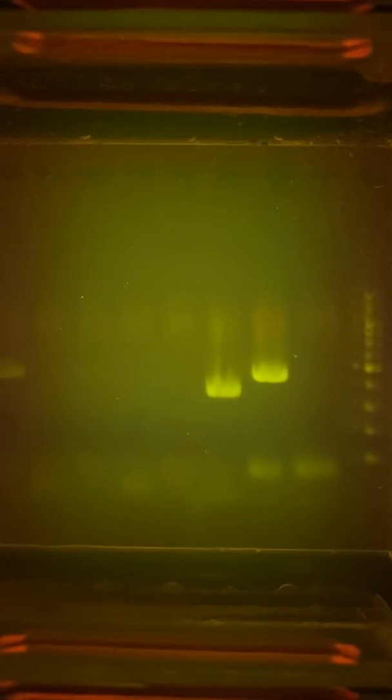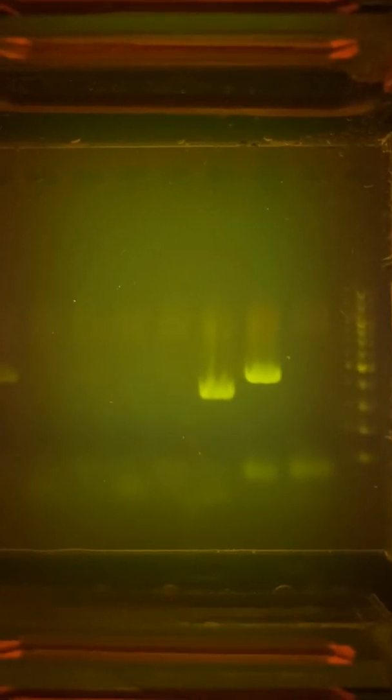Super, super cool. So I can know which ones of my single ascospore cultures I can mate with each other. We have single cultures that are hopefully going to produce really, really beautiful Cordyceps mushrooms at a commercial scale. And the more that we learn about the molecular biology of Cordyceps, we might be able to understand why they degrade into non-fruiting cultures in such a fast time span. Lots more to learn. I'm not very fluent in what I'm doing right now, but at least I know enough to get this done, and I'm very excited about it. Hopefully we can all learn together.